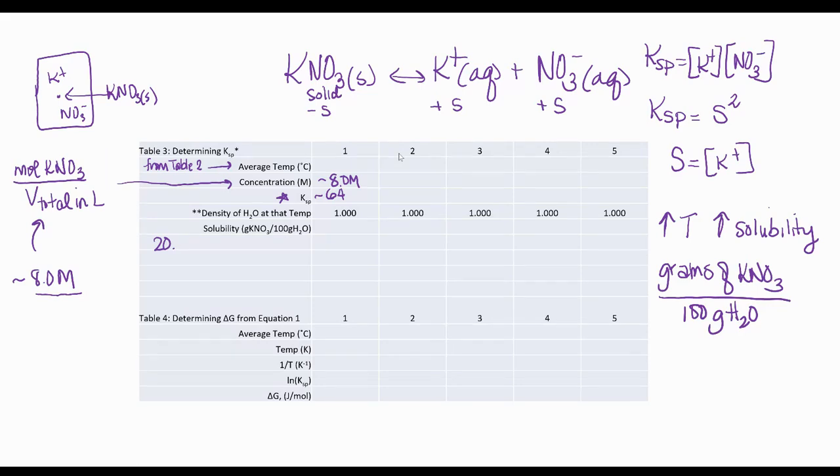Okay, so 20.2364 grams of the salt in 15.05 grams of water. So the question's going to be, how many grams would dissolve in 100 grams of water? So that's going to express our solubility for that one. And you can go ahead at those different temperatures, because you have different temperatures here, to determine the solubility per 100 grams of water.